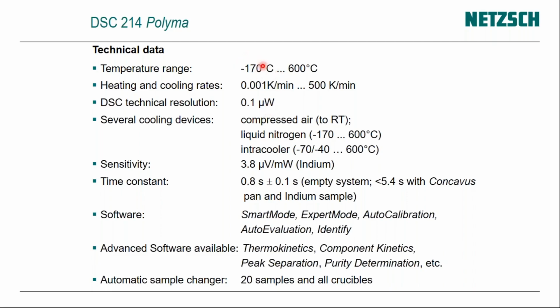Now, how do we achieve this sub-ambient temperature, the cryo temperature? How do we achieve that temperature? We have different cooling systems.